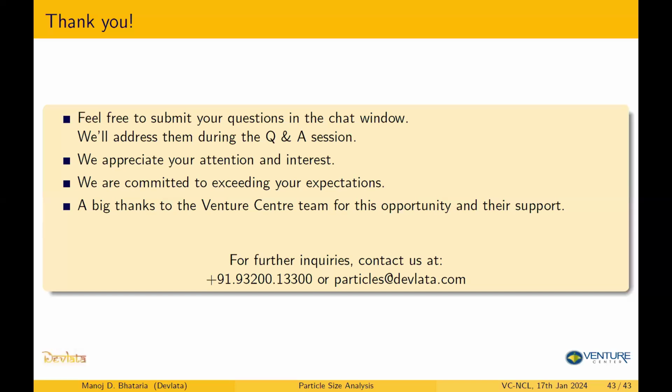So, will it be giving any garbage value, or won't it give a repeatable value for our analysis? What will be the analysis result in that case? If you have a very broad size range, let's say a sample with sizes from beyond 10 nanometers to even lower than 1 nanometer, in one single sample, it's very difficult to have such a sample.